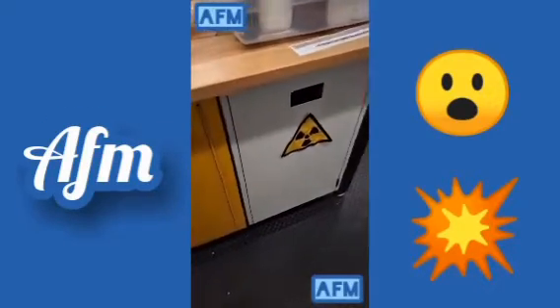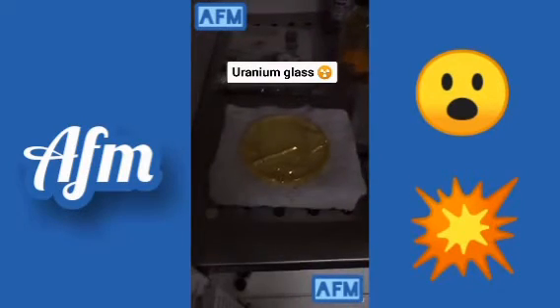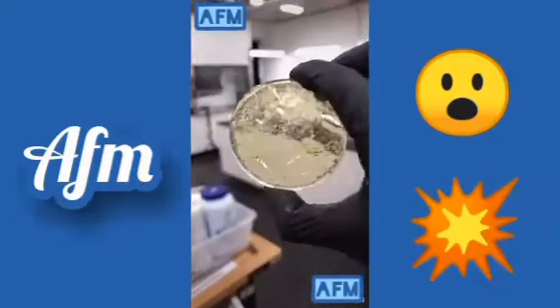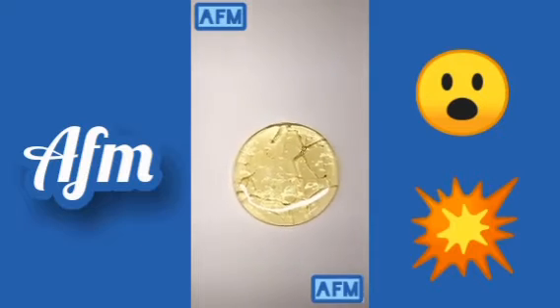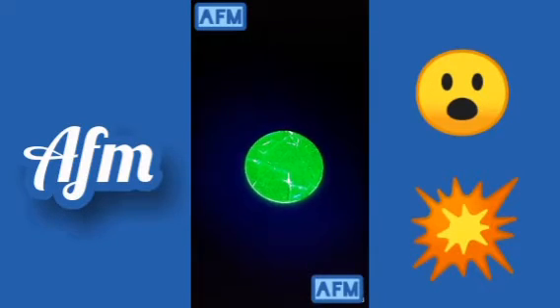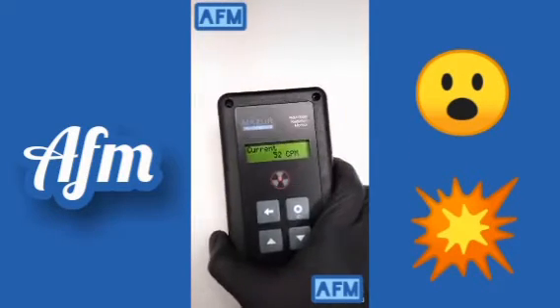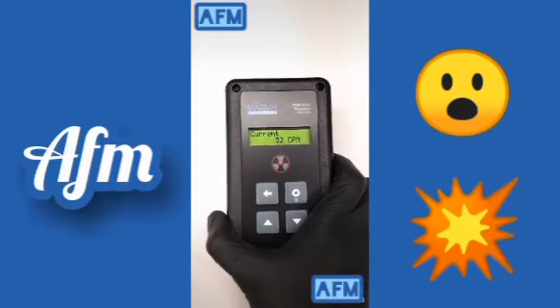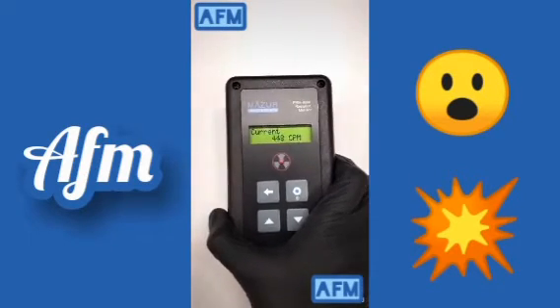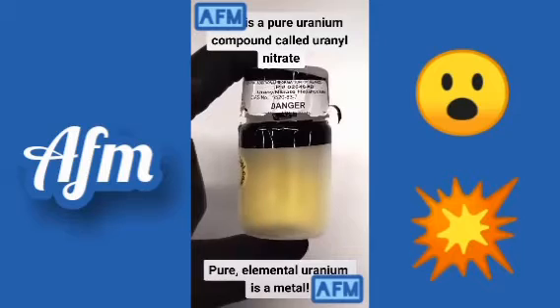This is my radiation cabinet, and here I have my uranium glass. I made it myself, and it actually contains uranium. What's cool about it is that it fluoresces under a black light, and it lets off a really nice green color. Because it contains uranium, it is radioactive, and this can be detected using a Geiger counter. Every time it beeps, it's detecting a radioactive particle, but it's actually not that bad. This is because there isn't much uranium in it, and it's nothing compared to pure uranium.